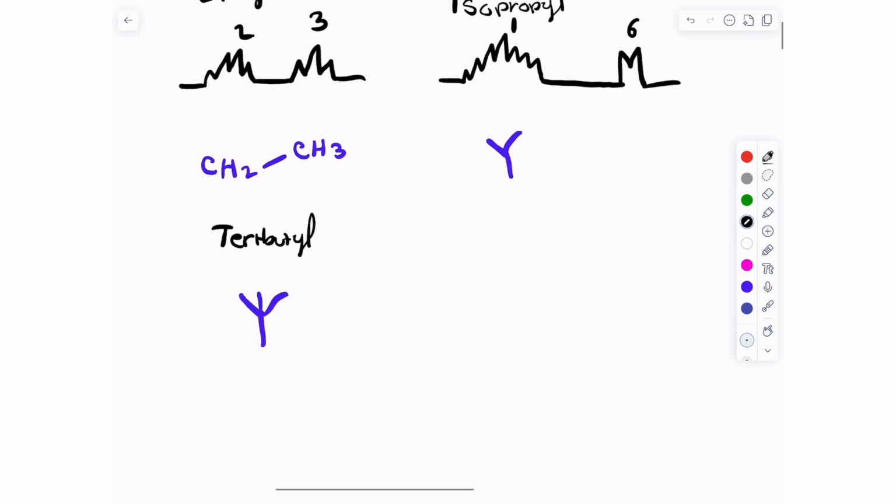Now we're going to get into the aromatic ring. So remember when I told you that seeing a signal of 6.5 to 8 is really important and you should memorize that chemical shift? Well, that's what I'm talking about here, because there are a lot of patterns that go with aromatic rings.